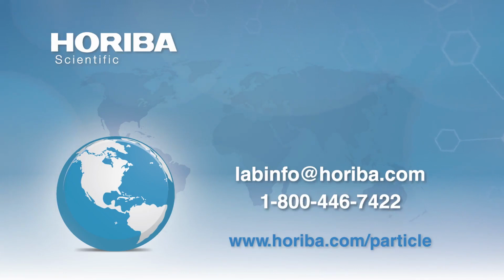Again, Google electron donor acceptor theory. Going back to the late 60s, Fred Fowkes and Mohammed Labib go into it in great detail. And yeah, the biggest variable in making measurements in non-aqueous media is water.